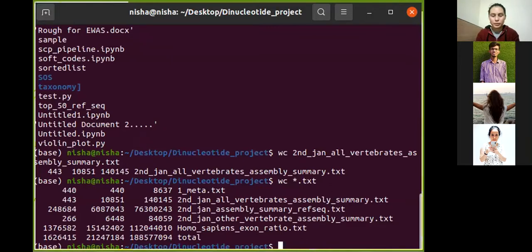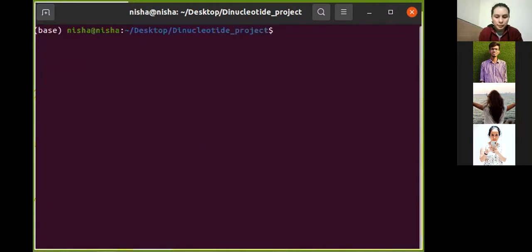Yes. Okay, cool. So if I want to visualize this file, I'll clear the screen and then type head. I just want to see the beginning, and 100 lines I want to see.